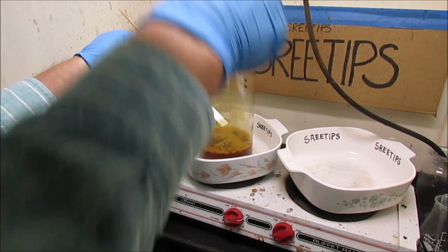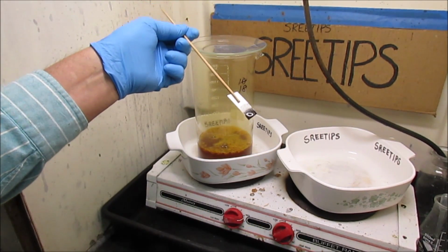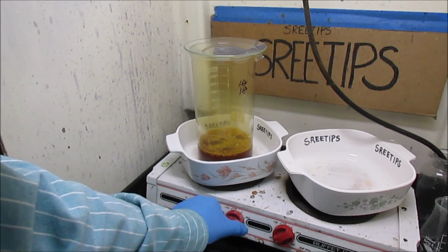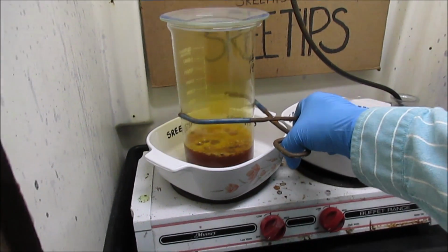Come on. Oh yeah. Gold in solution. Turn the heat off here and just let this slow down. Pull it down off the heat. Let it cool off.